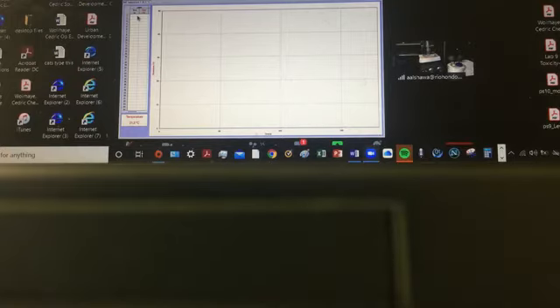Can you tell me what's the initial temperature of the water inside the calorimeter? Because I measured almost 75 grams of water inside the calorimeter. Celsius, 21.3, right? Let's write down that number.